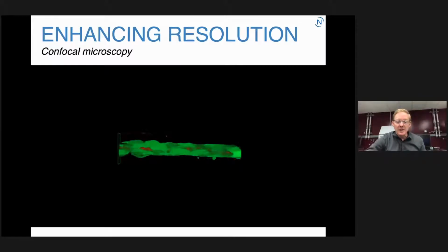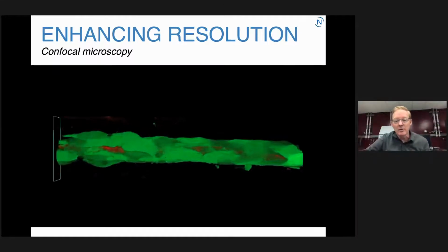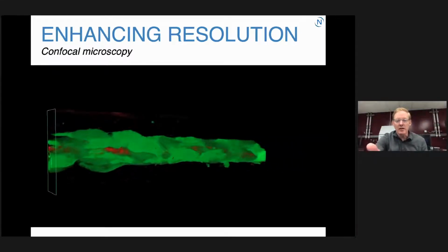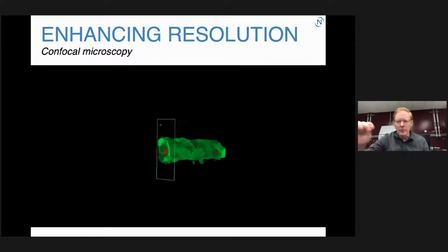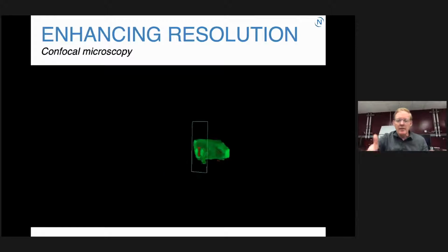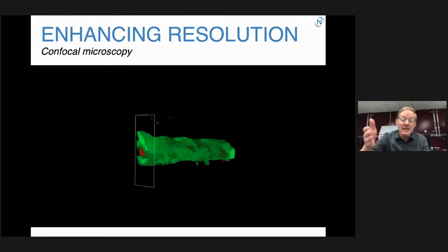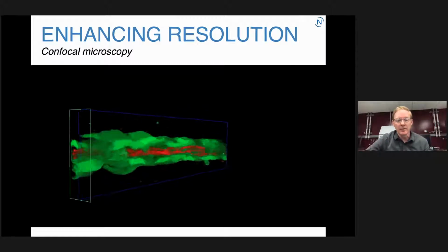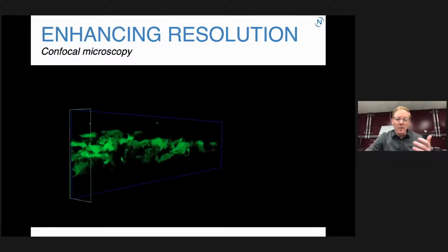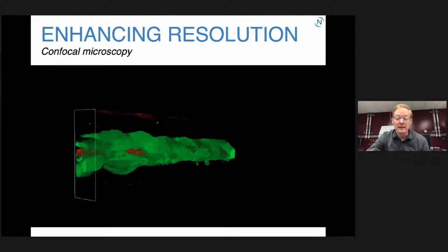But what you also see now is that if you scan that pinhole in space, you can now generate three-dimensional representations of an object like this, which is actually an artery, right? Looking at how cancer cells move through the vascular system, where you now can take individual slices and reconstruct them in 3 dimensions into a 3-dimensional image, where within every slice, right, we have a very, very nice high-resolution image where everything is in very clear focus, right? So confocal microscopy, the advent of this sort of technology, really pushed things forward quite a bit.